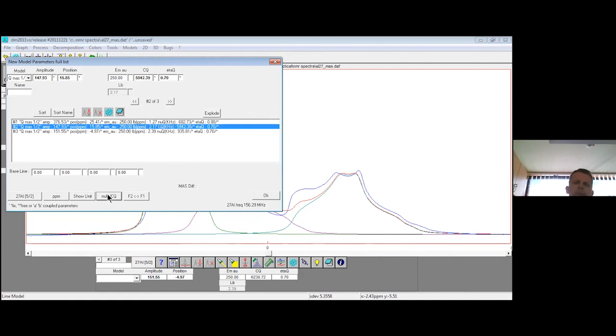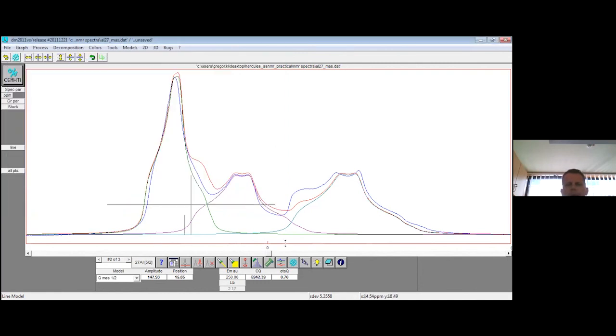These are actually the same parameter in different units, in units of frequency or in units of radians per second, in angular frequency or in true frequency.